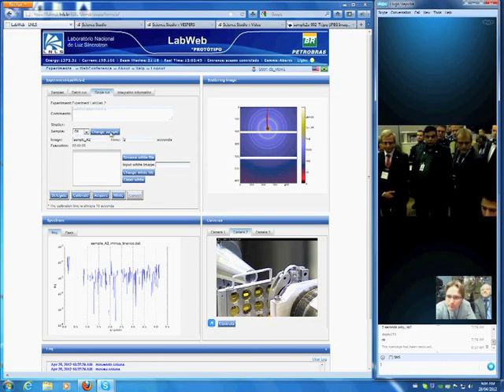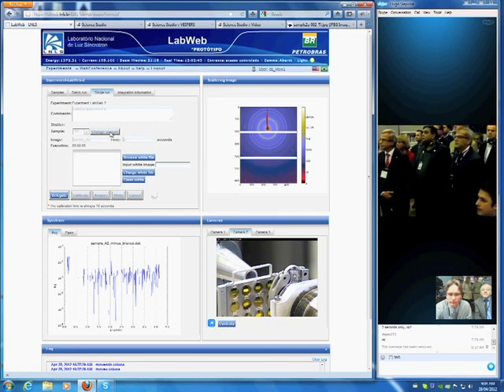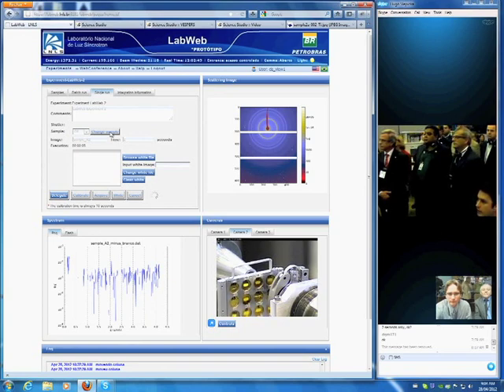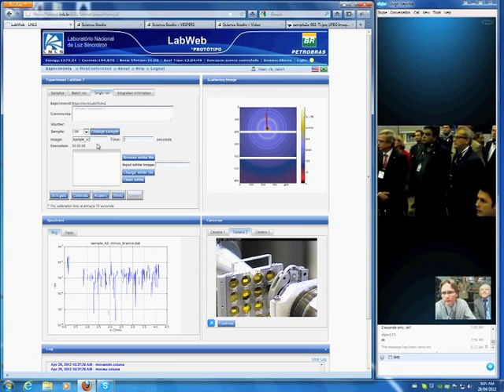Okay, can you do the sample of petroleum? Okay. So now we see that it's moving into the position. You see that the sample is actually quite black. It's petroleum from the pre-salt reserves. He is controlling. Yeah, exactly. He's controlling the sample. So he's putting the sample into position. There it is, the sample. It's a black spot. It's very thick oil.